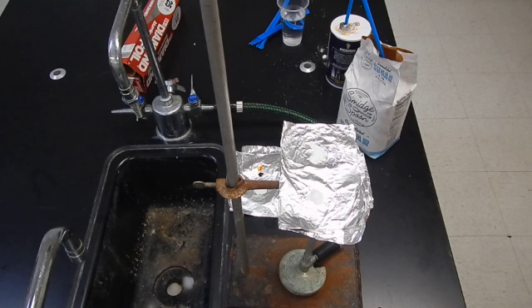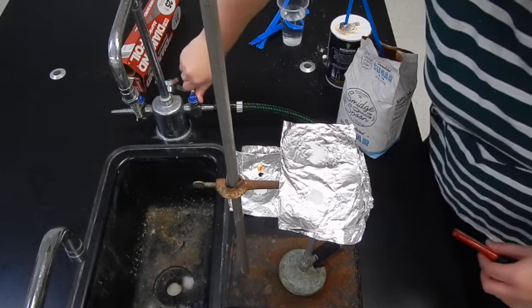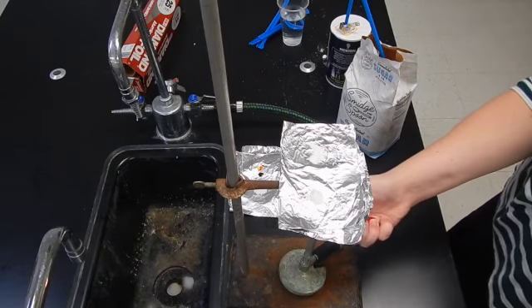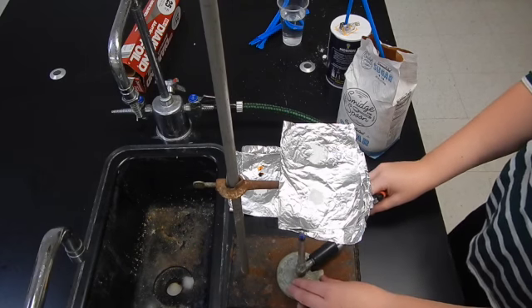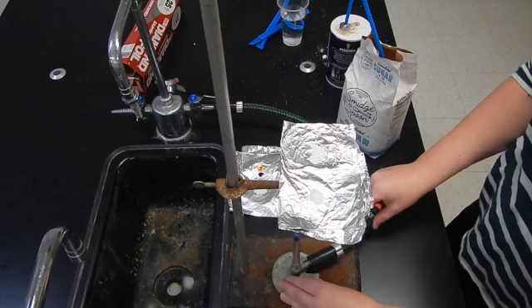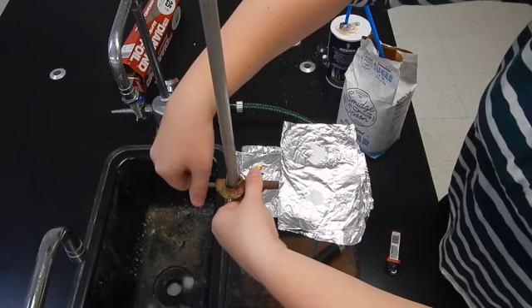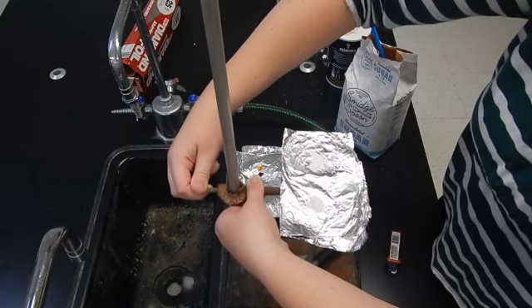So now I'm going to light the Bunsen burner and adjust the flame height so the tip of the flame is about 1 inch or so below the aluminum foil. And then we are going to watch and see which one melts first and about how long it takes for it to melt. I do need to lower the ring stand just a tad bit.